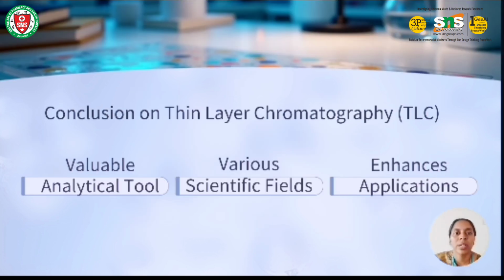In conclusion, it is a valuable analytical tool, and various scientific fields are using TLC methods, and it also enhances the applications.